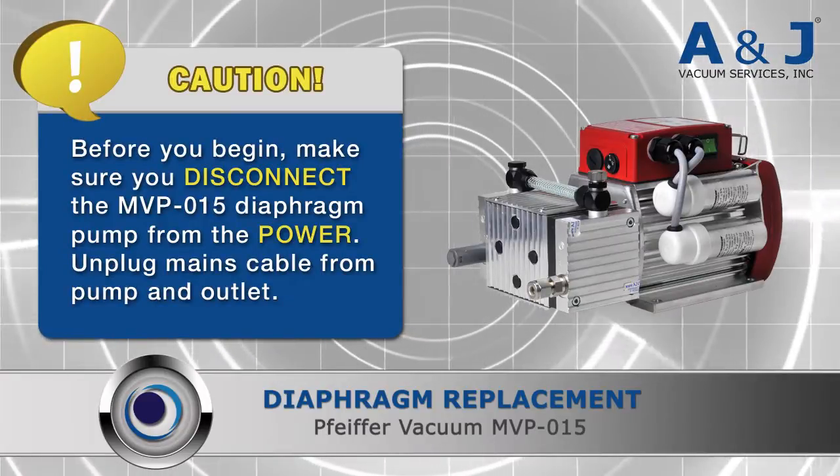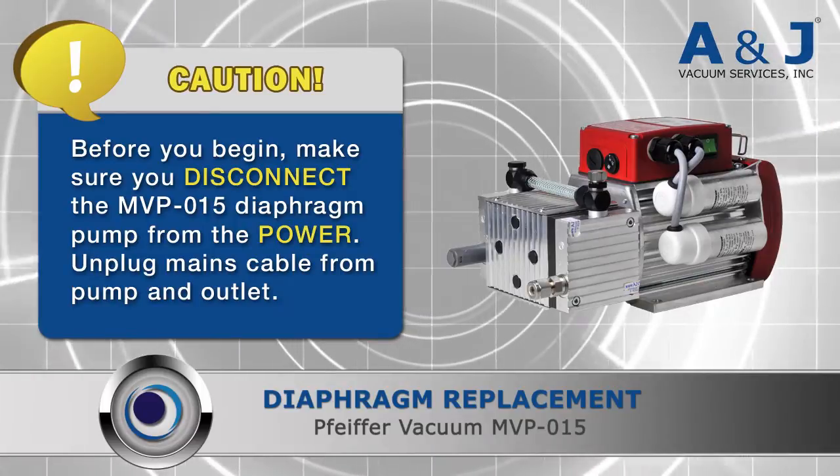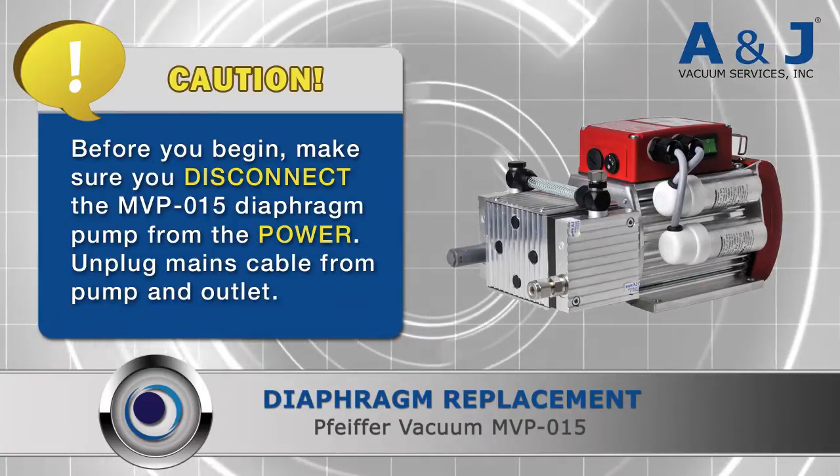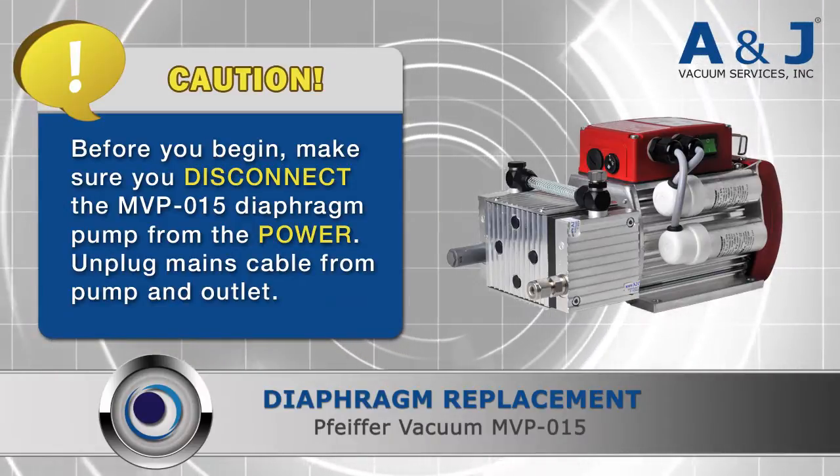Before you begin, make sure you disconnect the MVPO15 from its power source. Unplug the mains cable from the pump and the outlet. This is to ensure your safety and to prevent further damage to the pump.